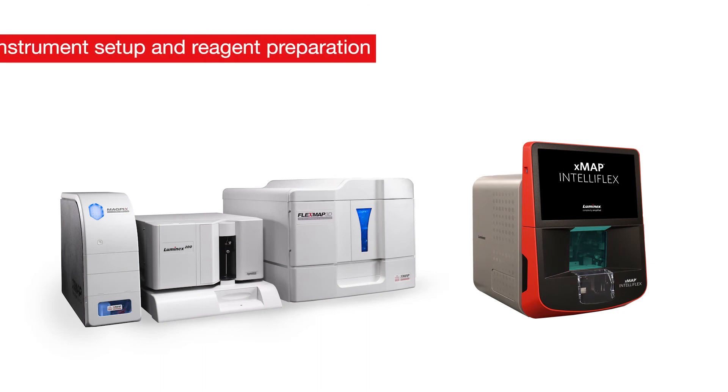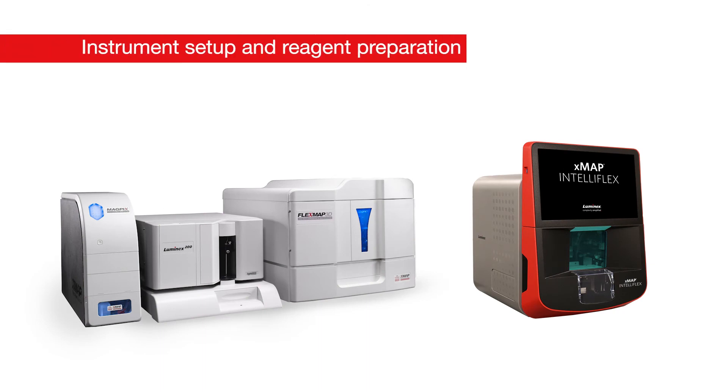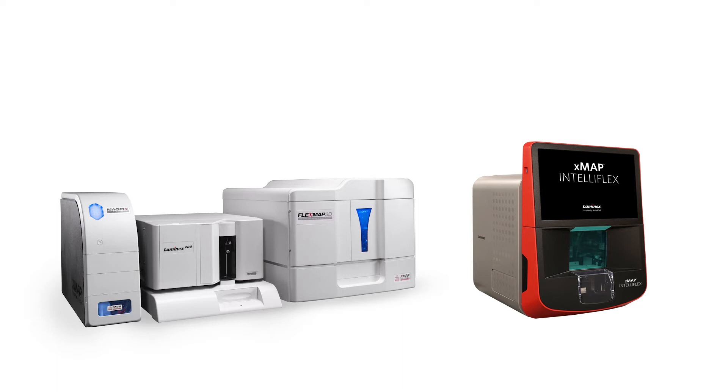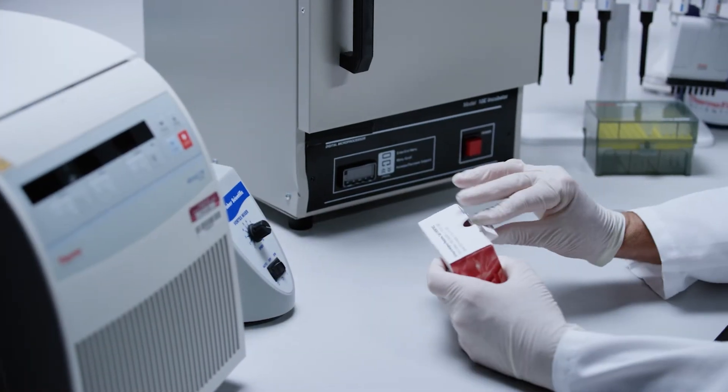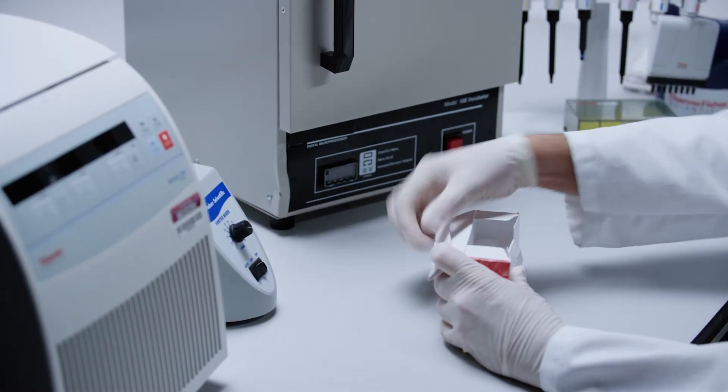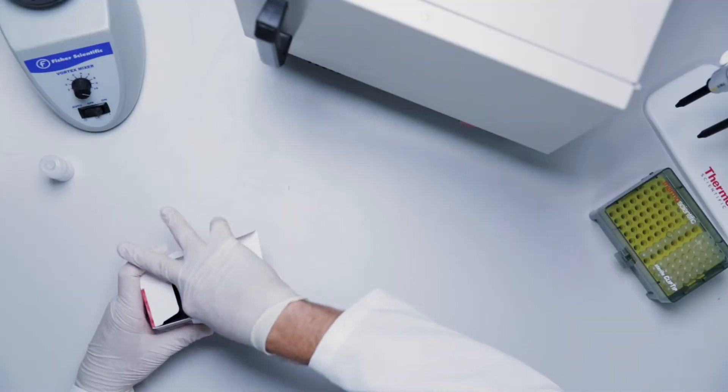On day two, allow enough time to warm up and calibrate the Luminex instrument, as the LX200 and FlexMap 3D systems require 30 minutes for the lasers to warm up. Refer to the user guide for more information on instrument setup, maintenance, and software navigation for protocol and batch setup. Make sure to have the protocol and assay batch defined so that the Luminex instrument is ready to read the plate when fully processed. Set the SAPE diluent on the benchtop to bring to room temperature prior to preparing SAPE wash buffer later in the protocol.